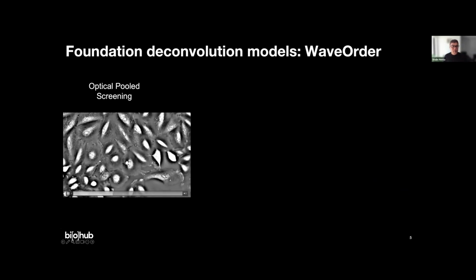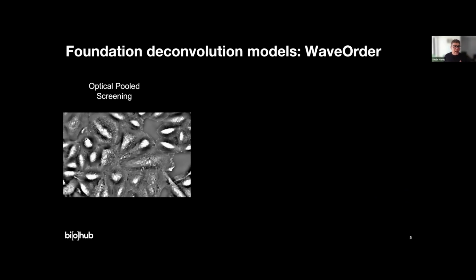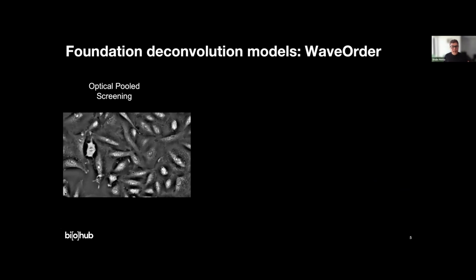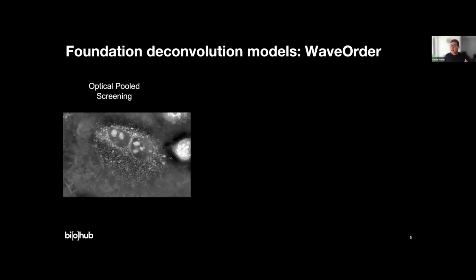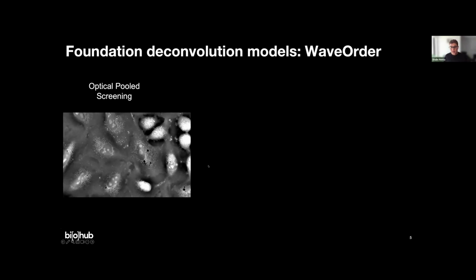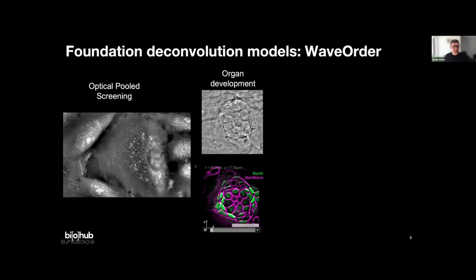There are large cells, there are small cells, cells with vacuoles, cells with different structure of nucleoli, mitochondria. So there's a lot of information packed in this data. So I like to say that we're packing biology in every pixel through this strategy. And I'll talk about how this results. How do we get these images?